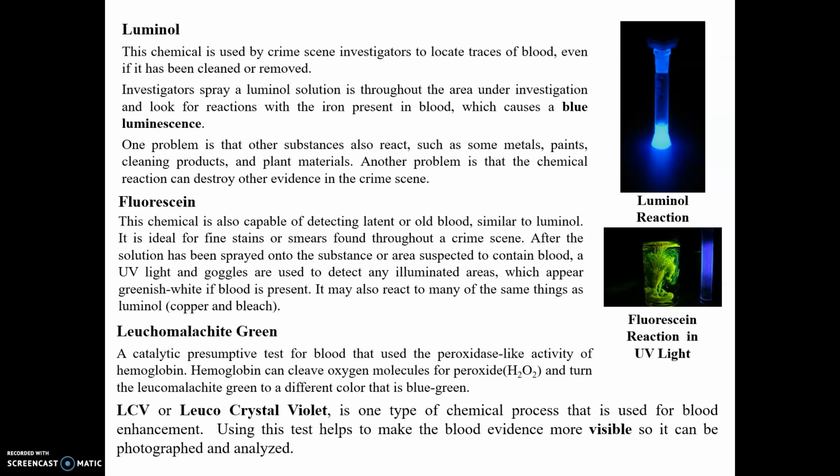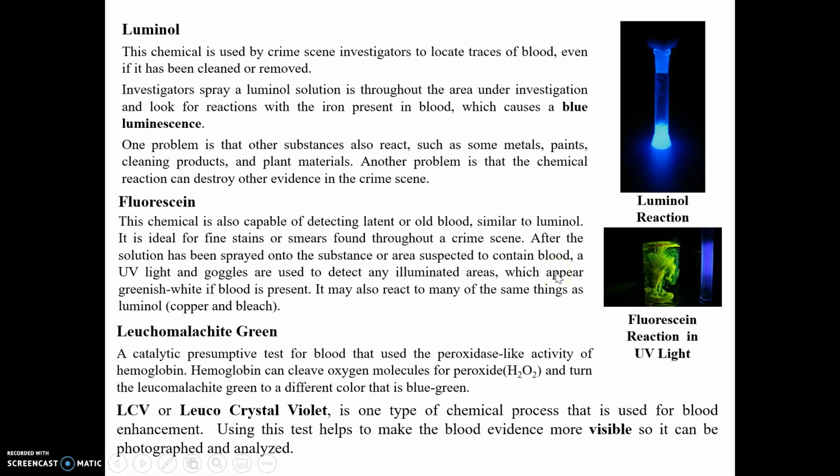And if it is illuminated, it will be a greenish white color, which if you take a look on the right hand side is basically a picture of the reaction that you would see with fluorescein. And then if you look, it has a UV light next to it, just to show you what the greenish blue light will look like when UV light is put on it.